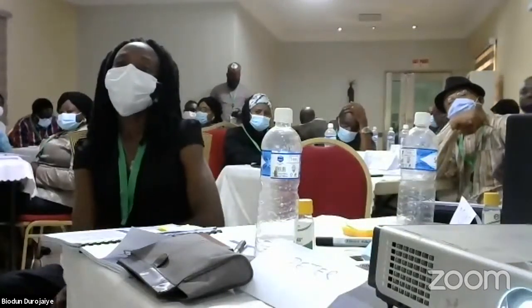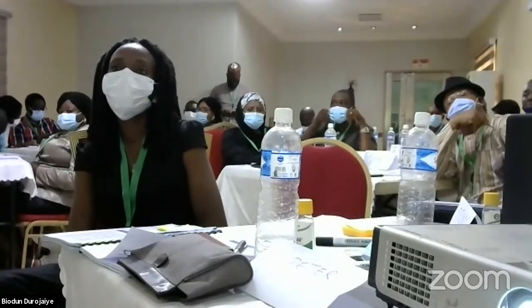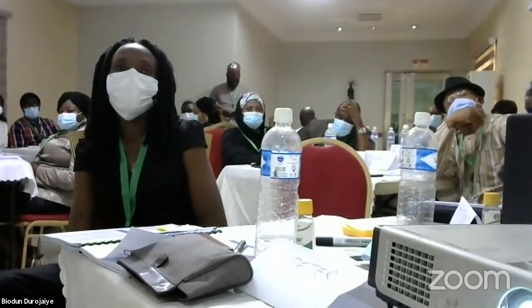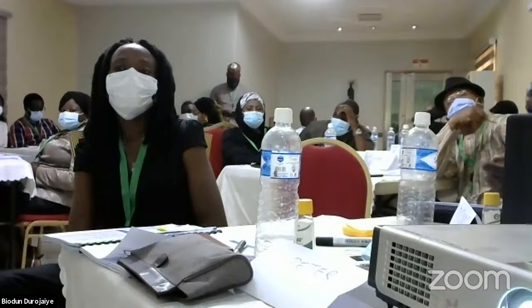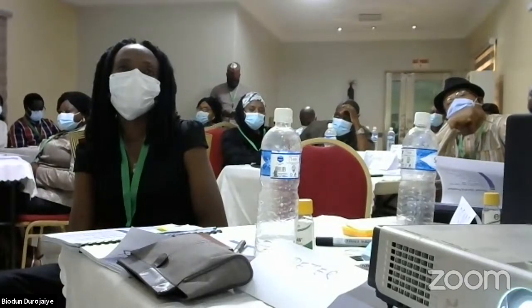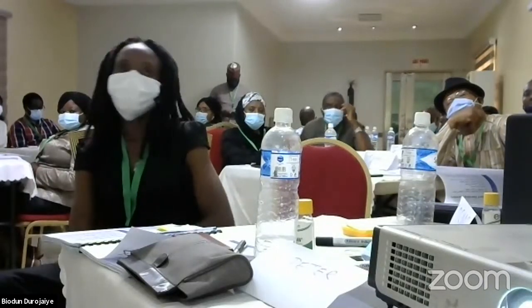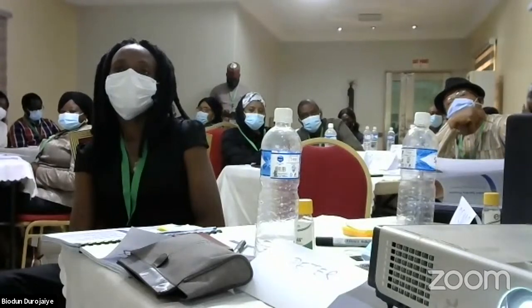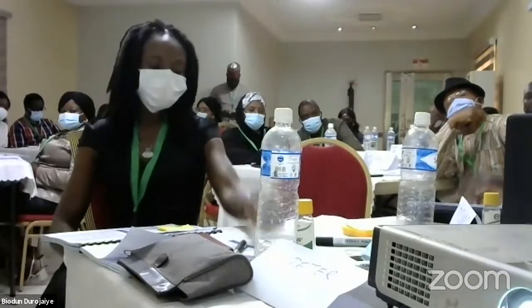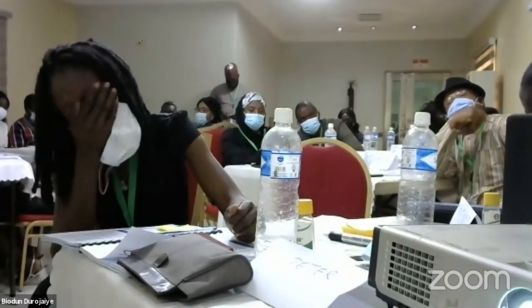Now, how do you know if an SOP is working? Well, of course, as we continue in the module, we begin to see some other conditions that we need to apply. For instance, are there people who have been trained and have experience to use that procedure? Or someone came in and began to use the procedure when the person is not adequately trained to carry out that task. These are very important. Of course, if everybody is using the same SOP and we are arriving at different results, it means that there is something we need to do.